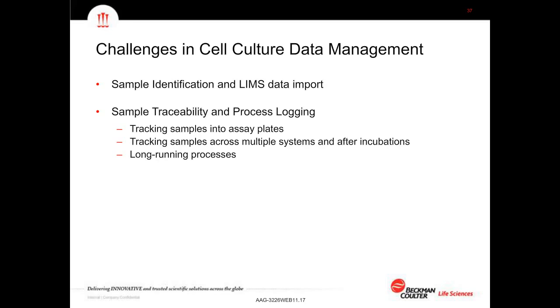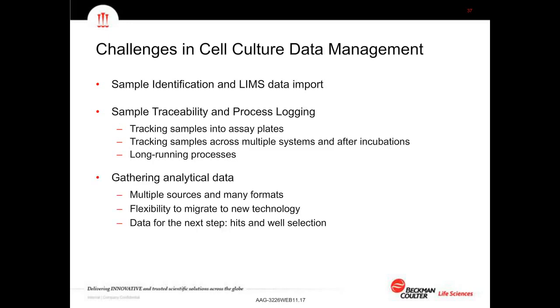After we've been processing the system, eventually we have some sort of endpoint. We have some analysis that's done. So how do we get this information? How do we bring it in? Because data exists in many different formats on disk. These data formats are changing constantly as new readers are introduced into our industry, and anything that we learn will then drive the next step, such as hit picking or clone selection.